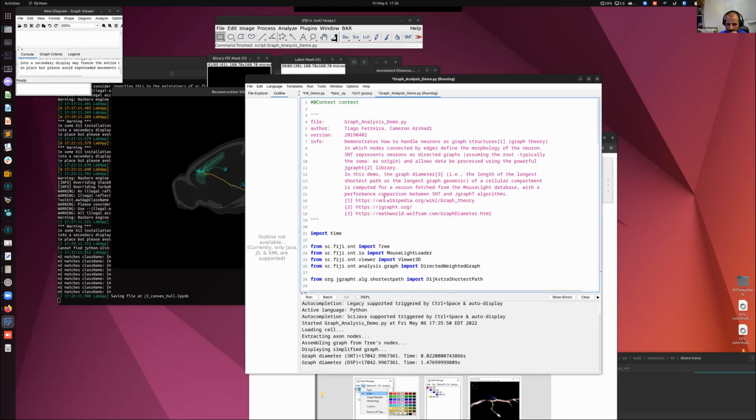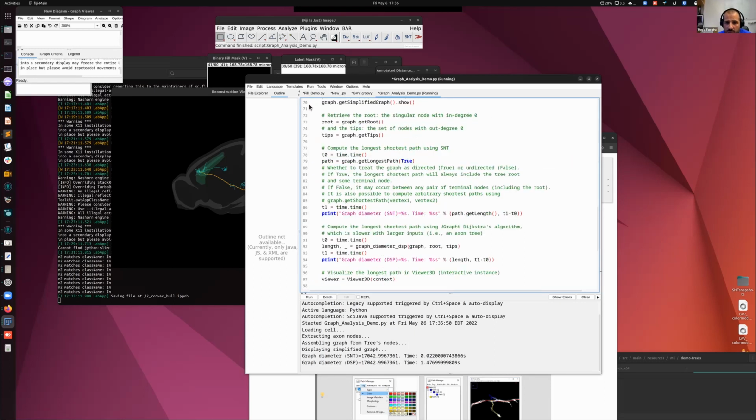We get asked a lot if SNT supports image macros, and the answer is no, we don't, mainly because we don't use it, and so it has not been a priority. However, there are ways to have a macro-like behavior, and maybe we can talk about those now.